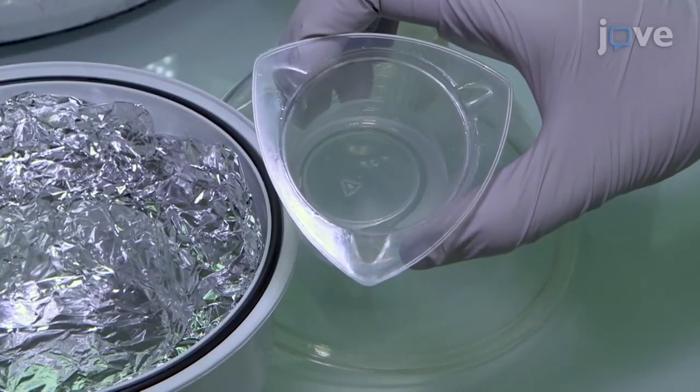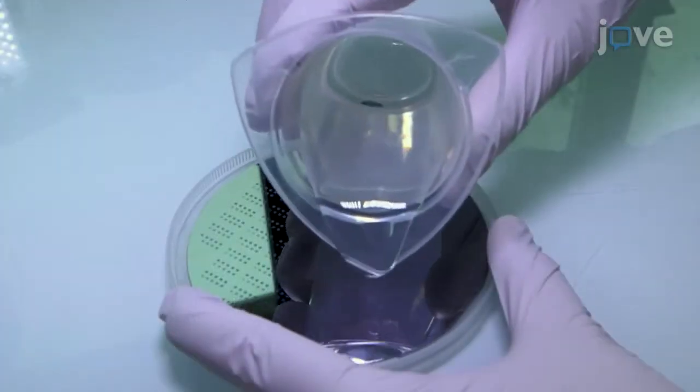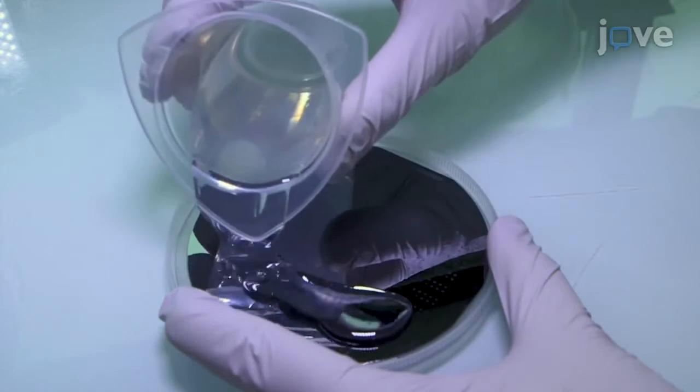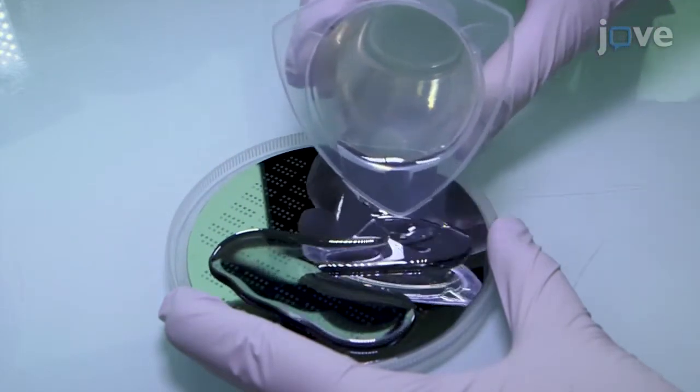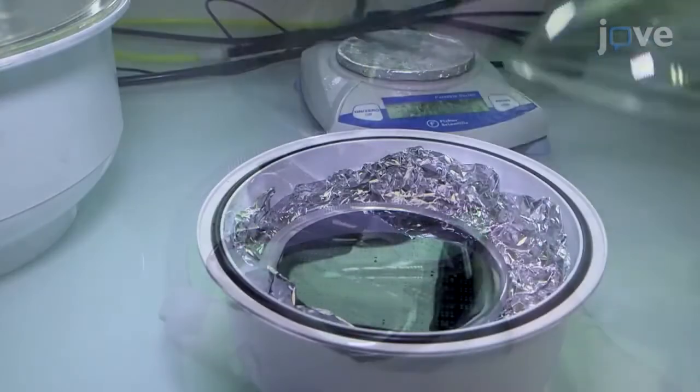When all of the trapped bubbles have been removed, pour 20 grams of the degassed solution onto a silicon master mold to a 2 to 3 mm thickness and degas again.